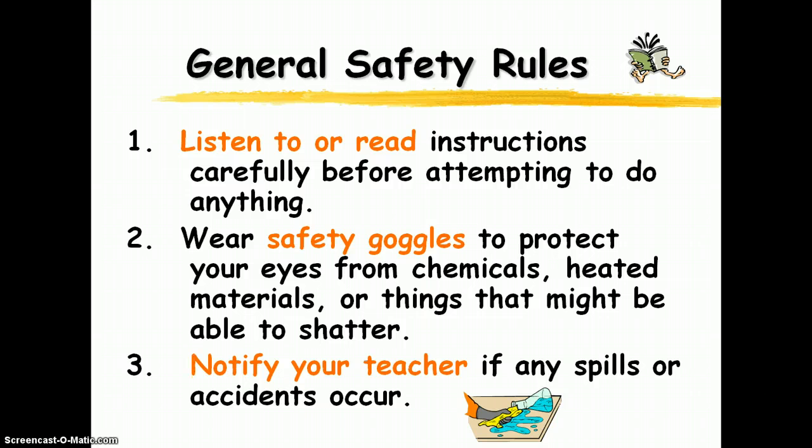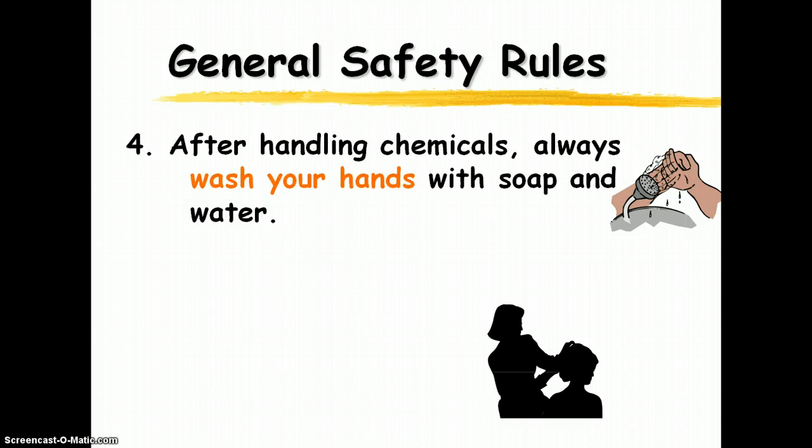If there's anything that spills or any accidents occur, notify me. Even if it's something small and you think it's no big deal, let me know so that I can take care of things appropriately. Always wash your hands with soap and water. You don't know what's been in the lab or what chemicals that equipment has come in contact with. So just on the safe side, as soon as you're finished with the lab, go ahead and wash your hands with soap and water.